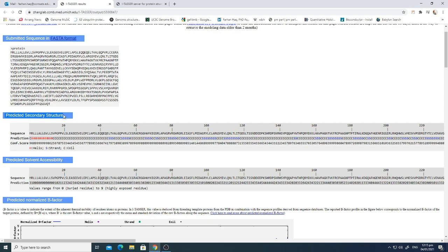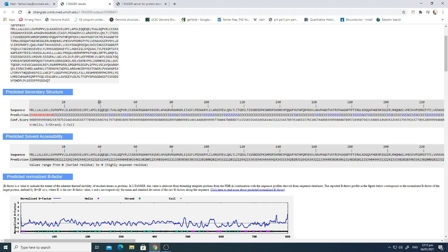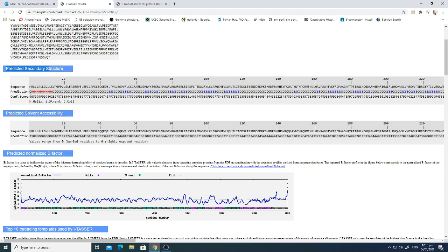Every result is given under a heading. The first is the predicted secondary structure. To analyze whether the structure is good or not, you can go through the scores and the overall structure. Different colors and abbreviations are used: 'C' stands for coil, 'H' stands for helices shown in red, and the blue strands are beta strands. The secondary structure of the protein sequence is shown with the submitted sequence on the first line and predicted structure on the next.